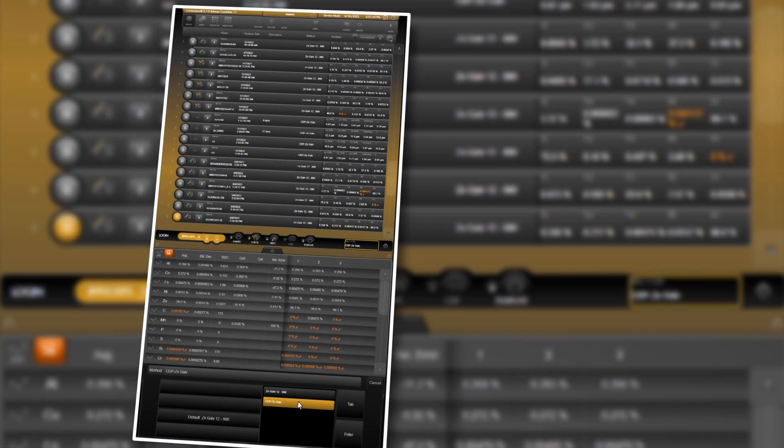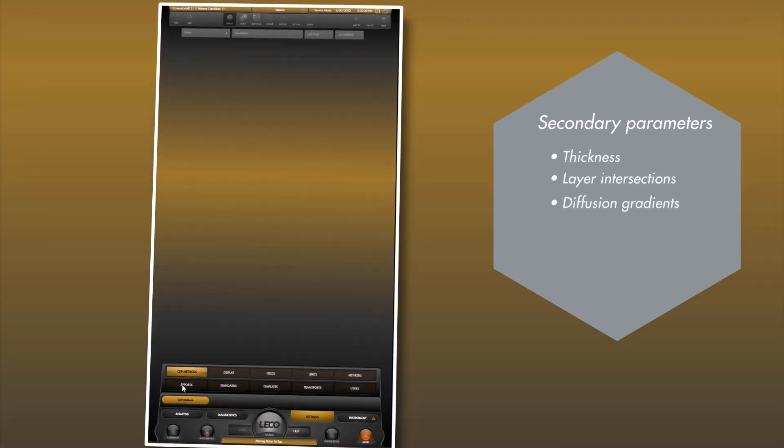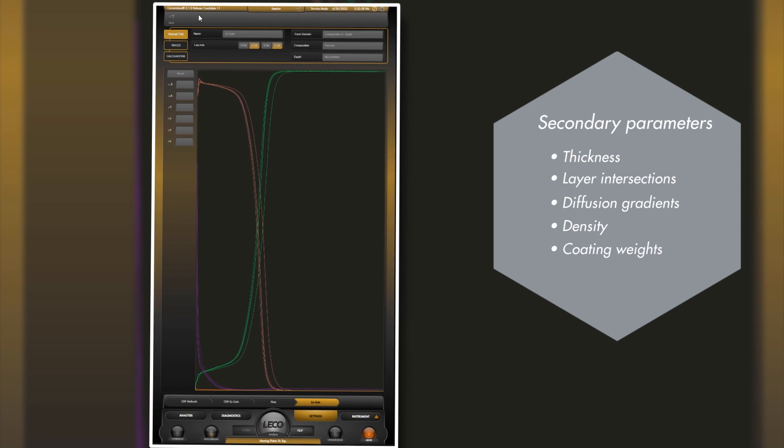Calculations can be created to determine secondary parameters like thickness, layer intersections, diffusion gradients, density, and coating weights.